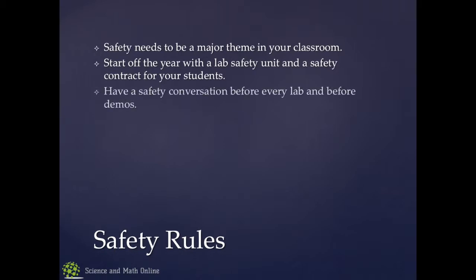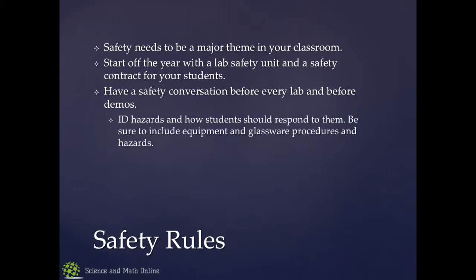You then, before every lab and before demos, you need to identify the hazards and tell your students how to respond to them. Every lab I do, no horseplay, no running around, no food or gum. You've got to be wearing the right clothing. Hair tied back, that kind of thing. Then you have conversations with them about how they should respond.